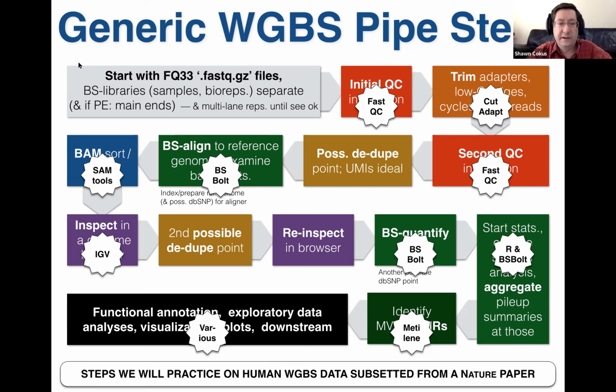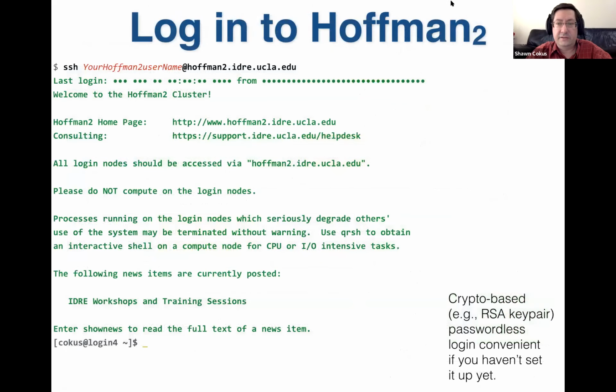So that's the plan. Now hopefully you can play along. Shrink this window or whatever, get a terminal window next to it on your local machine, and log into Hoffman. I sent an email out on Monday, and hopefully you've all got your Hoffman account squared away, and you can log in. That's with SSH.